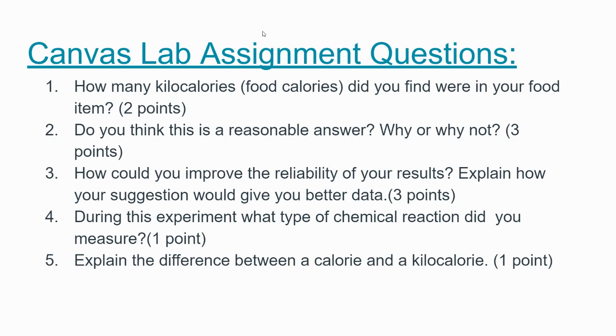Okay. All right, so this lab, we are going outside, but I am going to ask you to still wear safety glasses, just we don't want any flaming food in our eyes. This is also a lab where we will have a lighter, so if you have long hair, I'd probably pull back your hair just so that there's no chance of it catching on fire, okay?